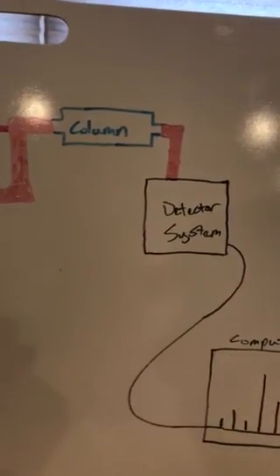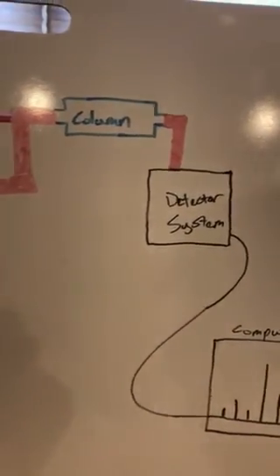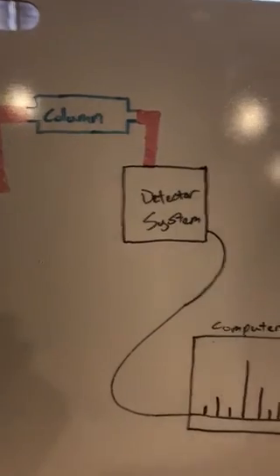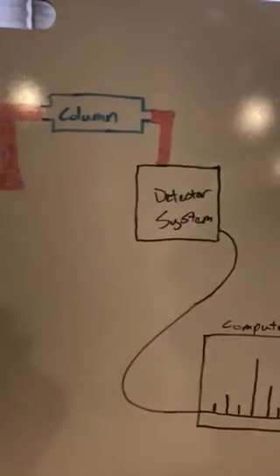This also gives us super high resolution, but the issue with tandem mass specs is that they're expensive and the maintenance required is very complicated. A good example of this is the turbomolecular pump. It's not cheap at all, and it takes a lot of time to fix any issues with it.